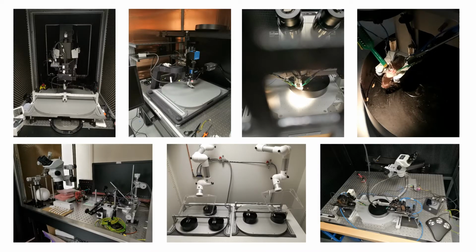This slide shows some pictures from the core facility. Here on the left, you can see the two-photon microscope, which is a special type of microscope that allows cellular and even subcellular resolution in the brain of an awake and behaving mouse.